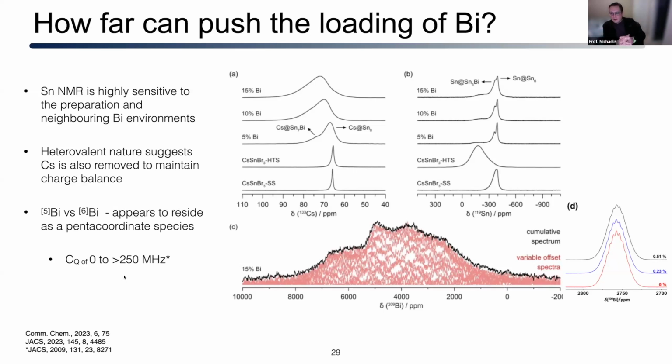Yeah. With a lot of that work, I think Bruker released a 1.3 gigahertz, and we have the 1.5 gigahertz in Tallahassee. Those might be the future questions that you can attack, right? Because that's where high field work would definitely help. Yeah, absolutely.